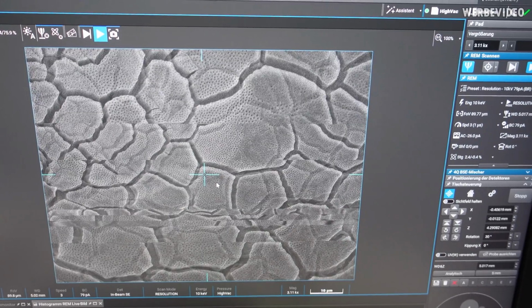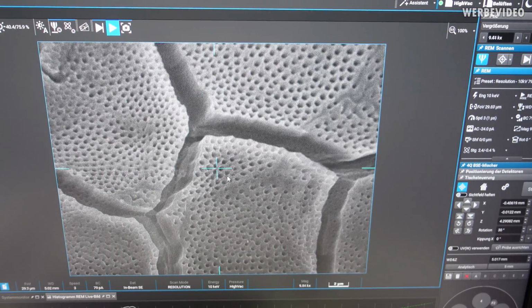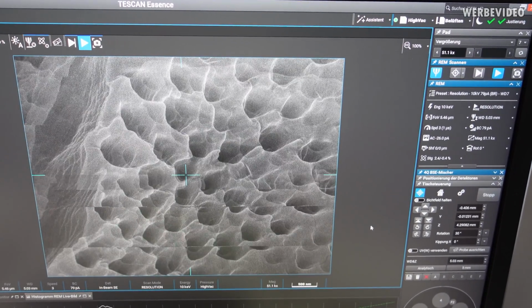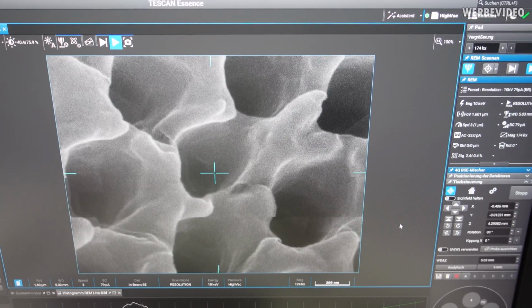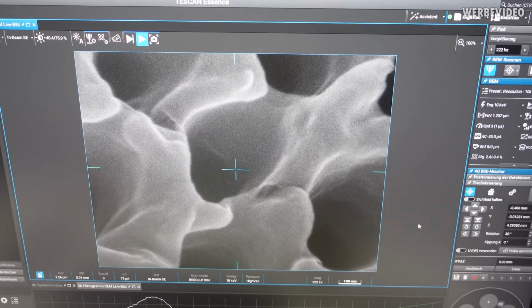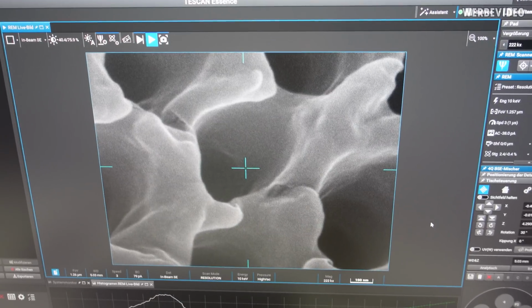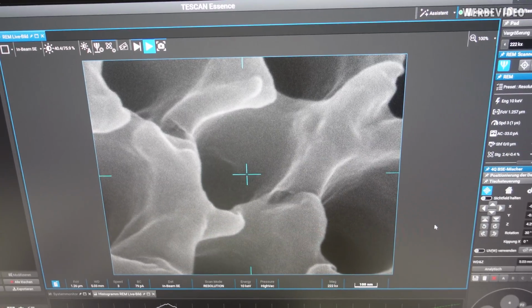Very interesting structure, about 1000 times magnified. 20,000 times magnified. No, 50,000 times. 100,000 times, and it's going up to, yeah, almost... well, it's over 200,000 times magnified. And that is the structure of the skin of a chameleon, and it has those kind of holes inside the skin, something you would never be able to see with your bare eye. It's just possible to see this in the SEM.